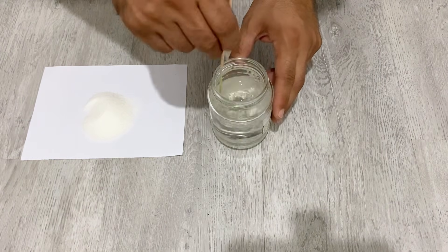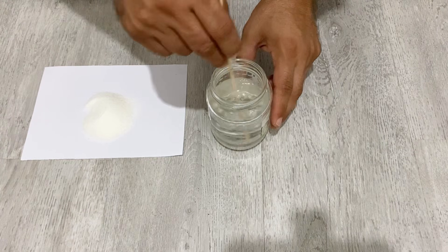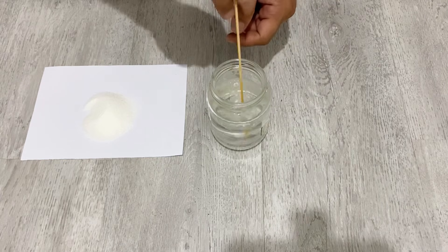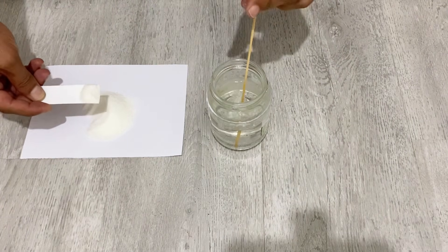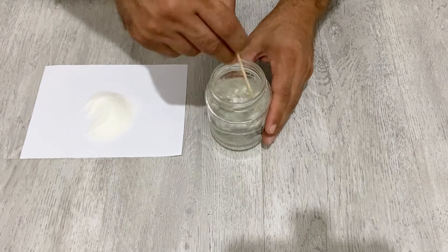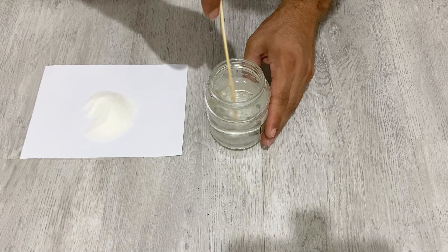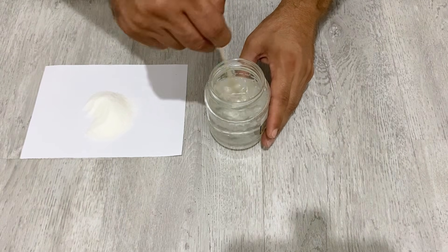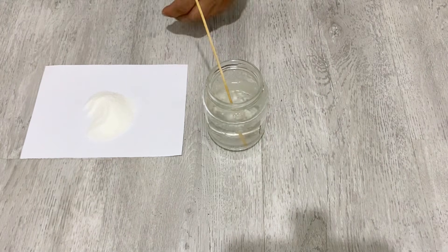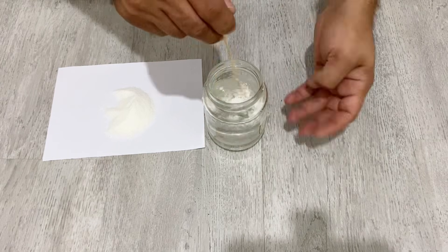Keep stirring. By the way, you should use deionized water. It's also better to use a wood stick for stirring; if you use metal, it can react with the water or the polyvinyl alcohol. So it's better to use a wood stick. Keep adding the polyvinyl alcohol a little at a time and stirring.